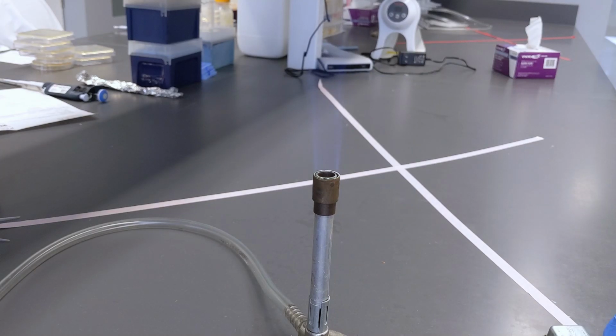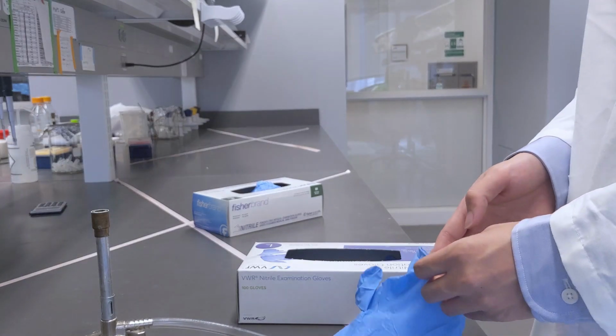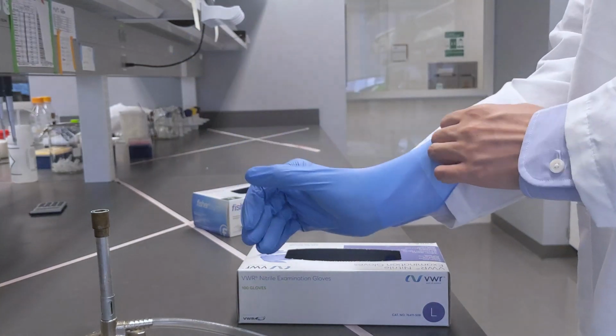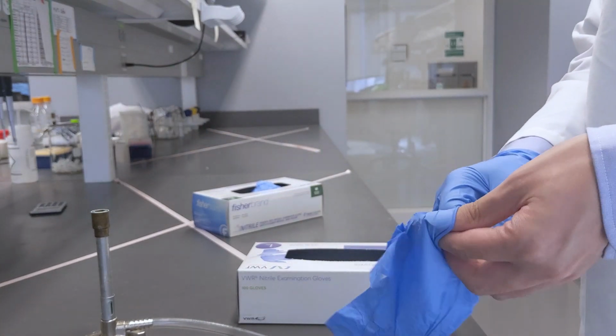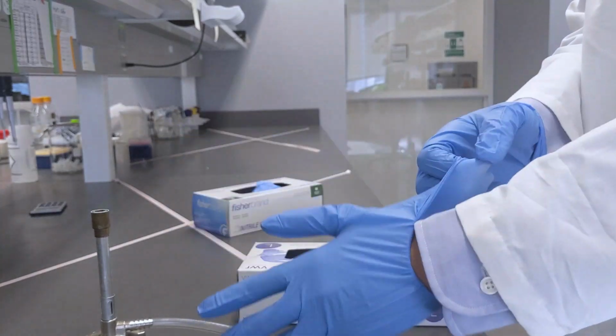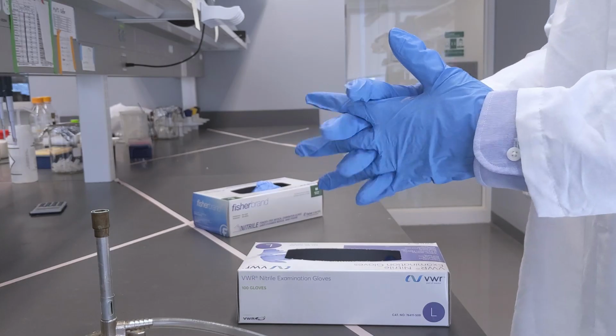Flame can create a cone of hot air above and around the bench to create a laminar airflow upward, so bacteria don't drop in this area. Gloves can protect the lab material from the microorganisms on our hands, as well as protect us from the microorganisms in our experiment.